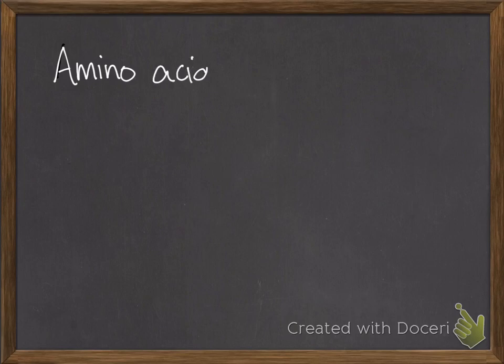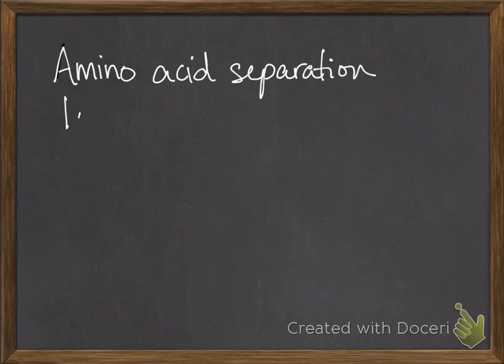I had a request to go over the experiment that was amino acid separation using ion exchange chromatography.